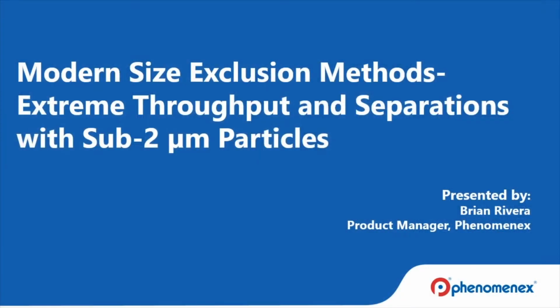Thank you for joining today. My name is Brian Rivera, product manager with Phenomenex. Today, we will be discussing size exclusion methods and how to get extreme separations in throughput with a UHPLC column format.